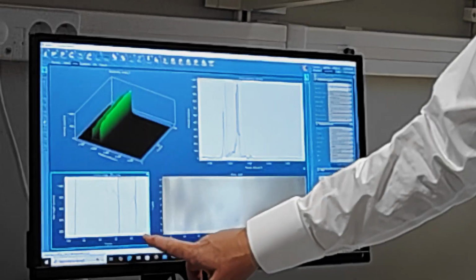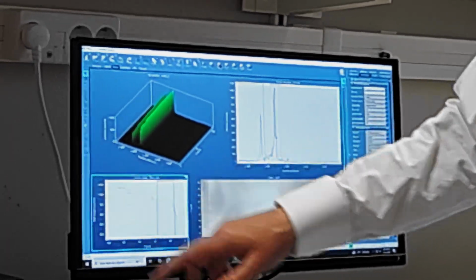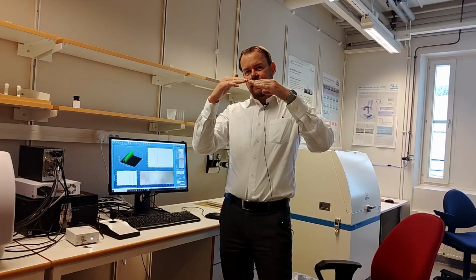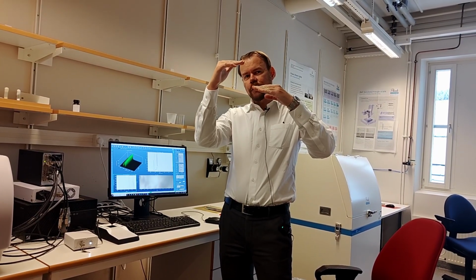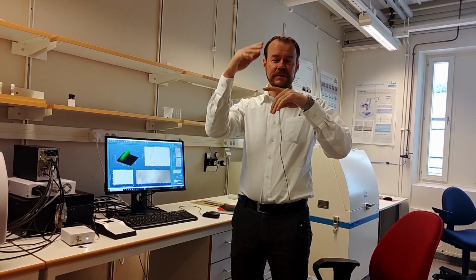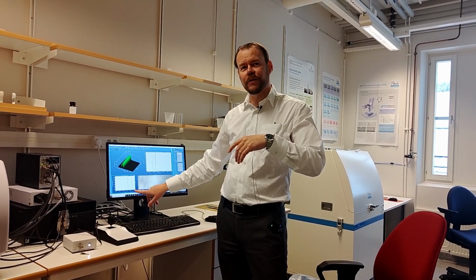And then we can see that first it was very low signal and then the signal is increasing. And that makes perfect sense because if you are a little bit out of focus first, then you are grabbing signal from the air, not the particles. So that's why most of the laser beam is completely out of focus at 0.0.